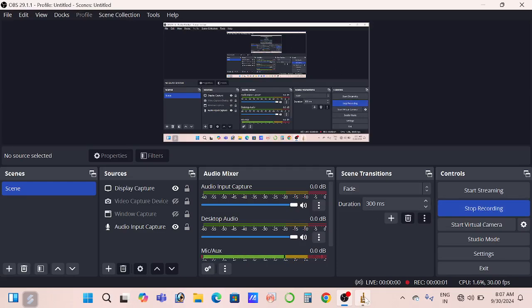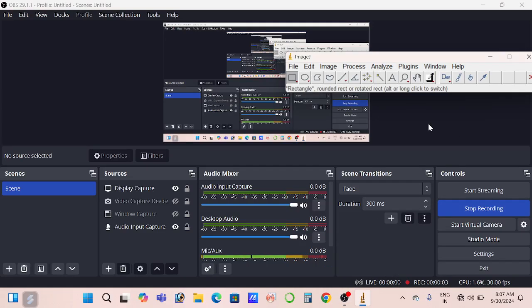Hello friends, today we are going to discuss particle size distribution. Particle size distribution is a very important topic because those who are doing research in material science and nanoscience generally want to find out the particle size distribution of the synthesized material.